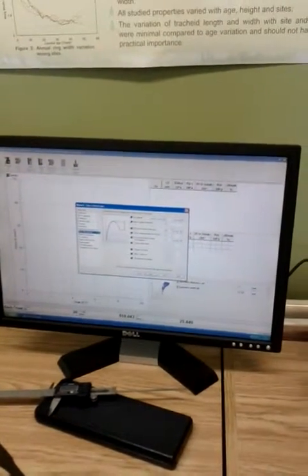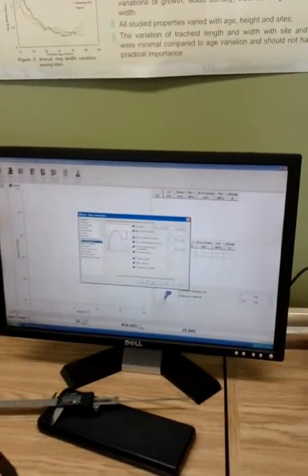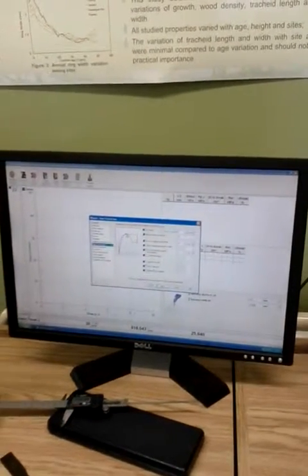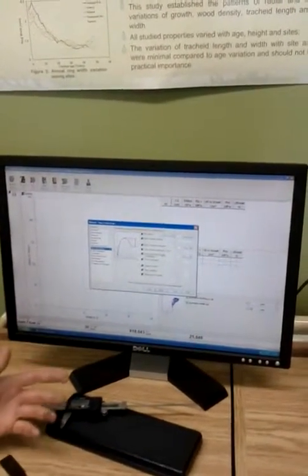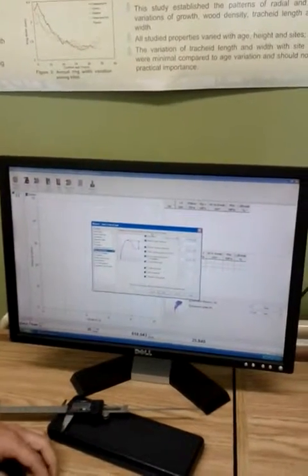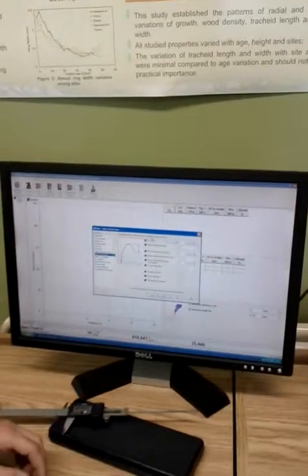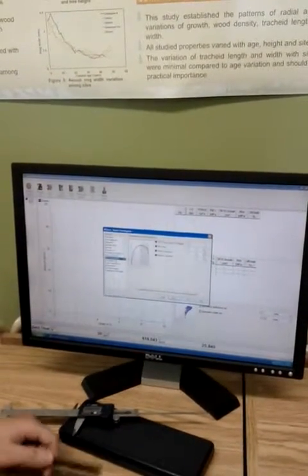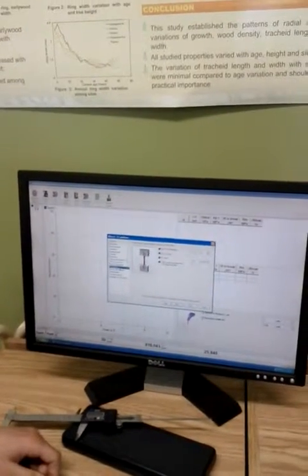There are many options, but in my case, the test ends when we reach 50% of the maximum strength. It depends. There are many criteria for end of test. But when I work with wood plastic composite, I use this. This is nothing interesting.